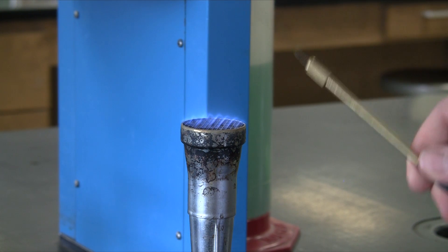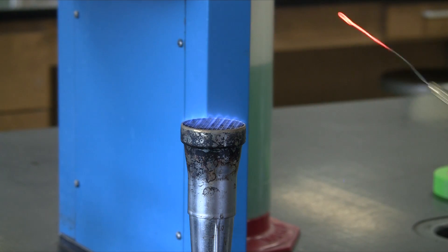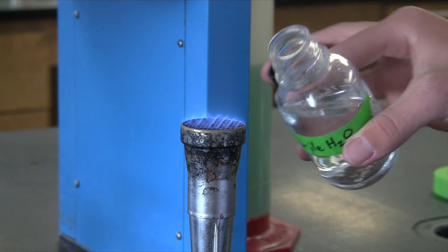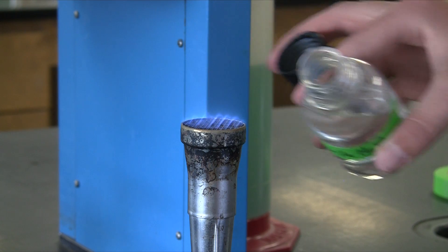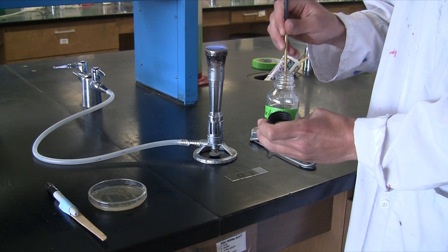We're now ready to add a couple of loopfuls of sterile water onto the slide. Go ahead and flame out your loop and place one to two drops of sterile water onto the area where you drew your circle.